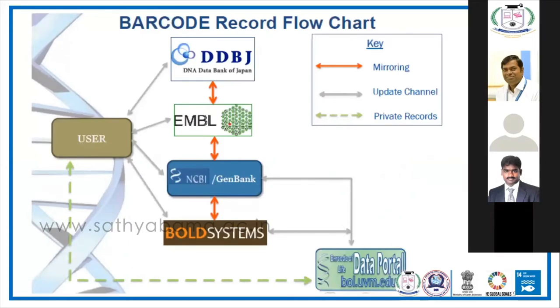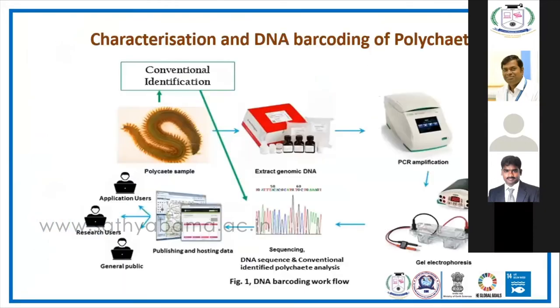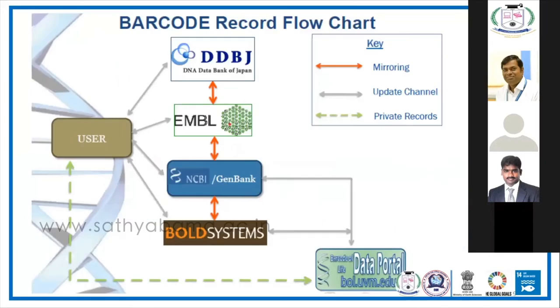This is the barcoding site to deposit our sequence. Unfortunately, NCBI and EMBL recently don't accept the DNA barcoding sequences. Mostly the Bold system and the DDBJ are accepting our sequence data. It is not easy to submit our sequence data into the Bold system or any other system. We need more information on the sequence. I will explain in detail now.